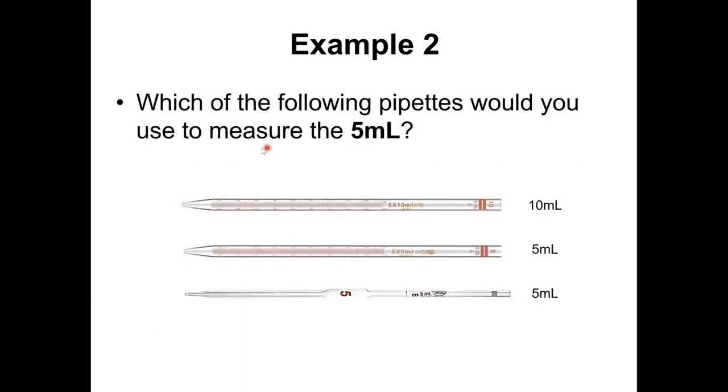Well, these are the pipettes you have in there. You're in luck. The 5 milliliter volumetric pipette is indeed available. So it's a no-brainer. You would take this pipette and you would do your measurement. This is, again, just reviewing, a single measurement type of pipette. So you will bring the volume up to this mark in here, which corresponds to 5 milliliters. And then you would eject it into the other container where you would measure the 250.